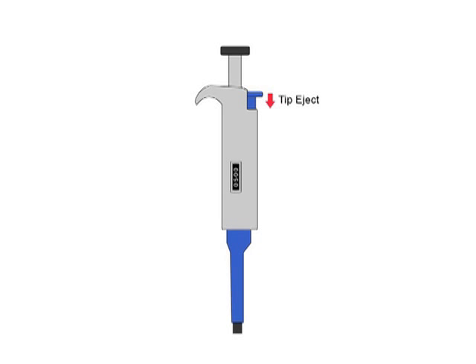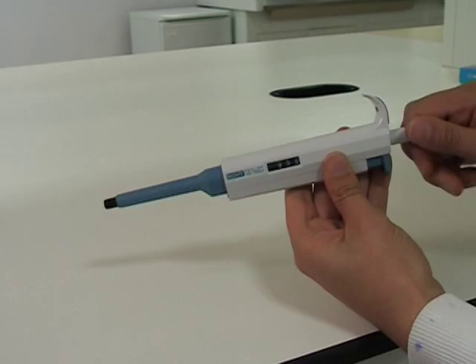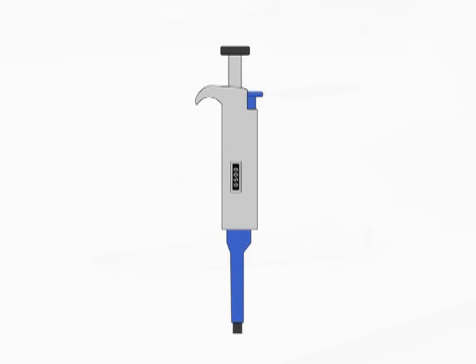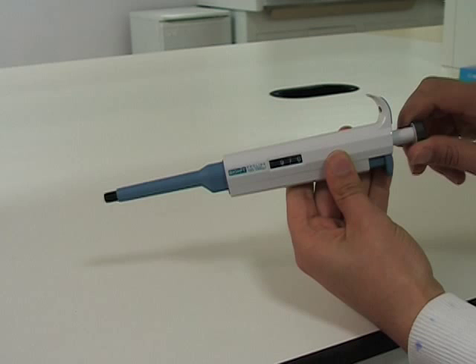Next, for a demonstration of pipetting. First, the volume is set. Next, the tip is fitted. It is important to get a good seal on the pipette tip to stop any leakage.